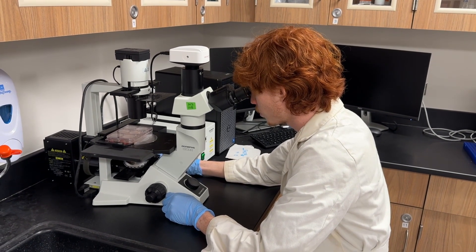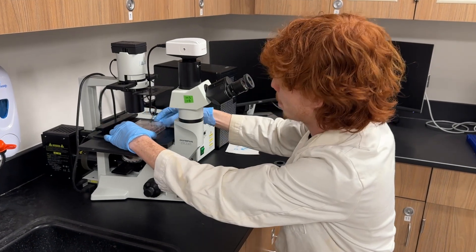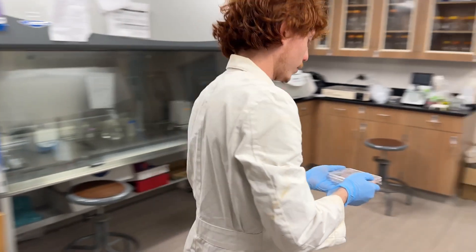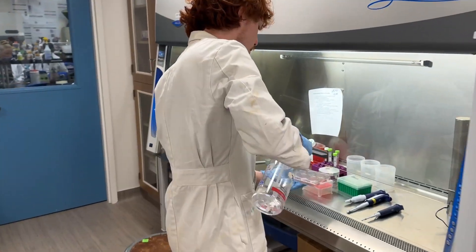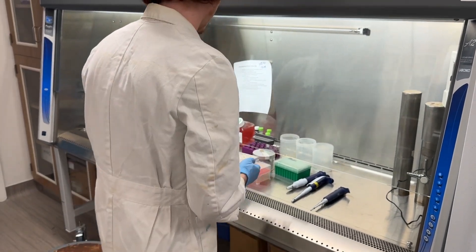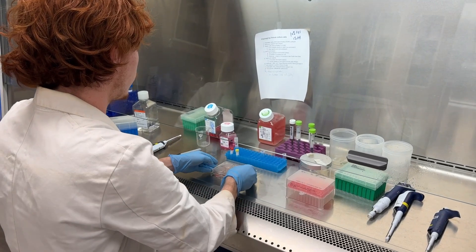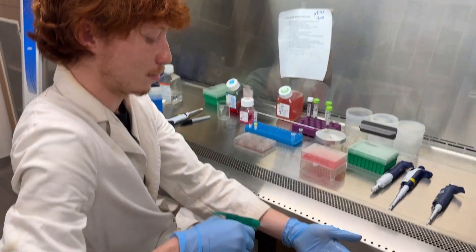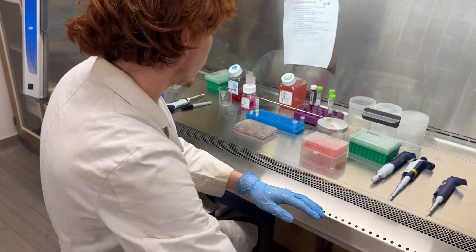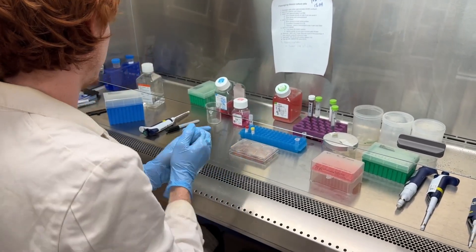Spencer checks: are these cells ready? He feels they're good to go. We take them over to our biosafety cabinet — generally we would have the cells ready in the cabinet beforehand, but in this case he did it after. Spray everything down like before, place into the biosafety cabinet. Don't forget to spray your hands every time you leave and come back.